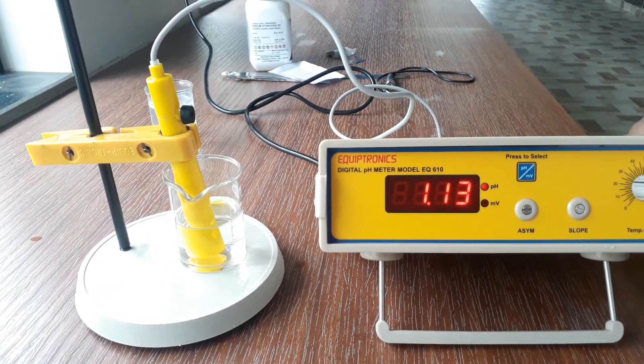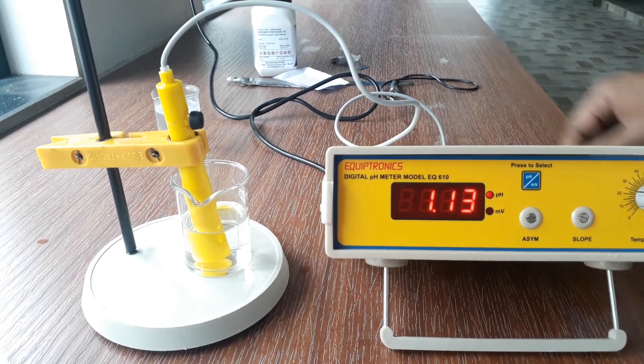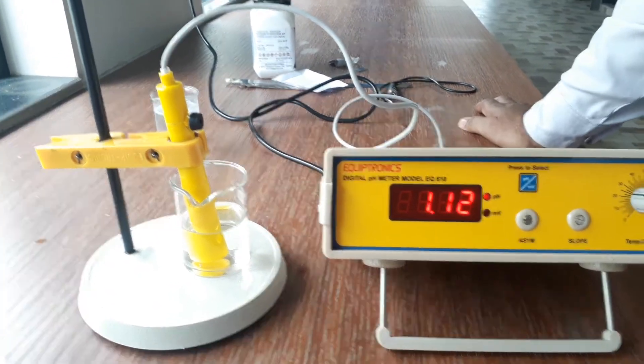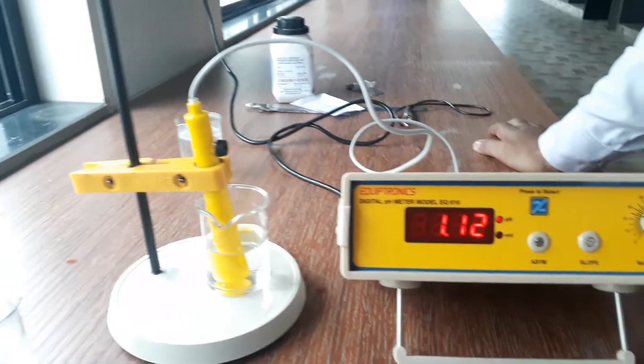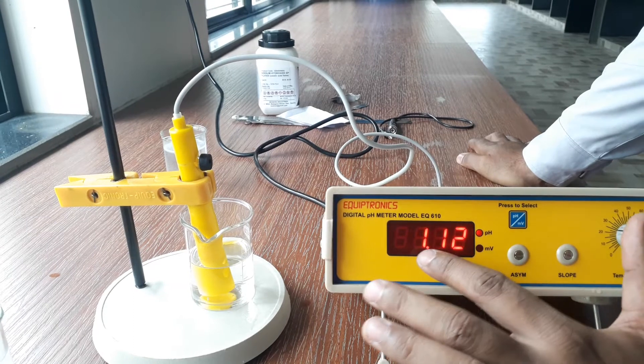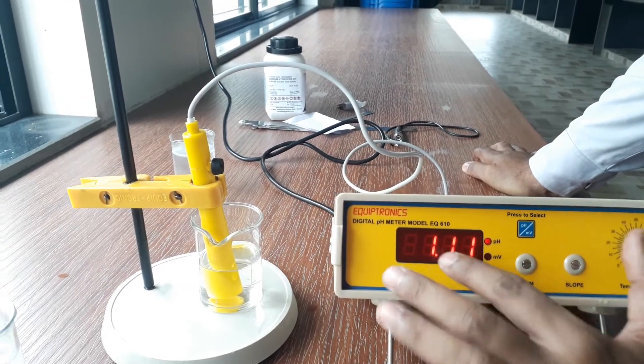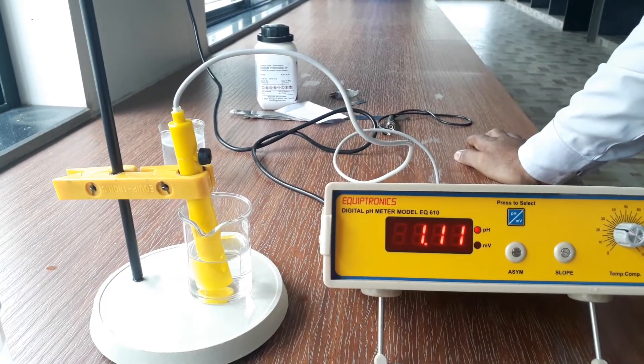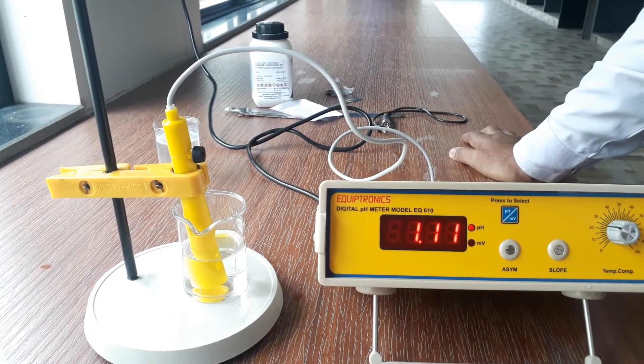But as we know the solution is HCl and we also know the range of HCl pH, that is from 1 to 2 according to its normality. Different pHs are there but it is nearly 1 to 2. So you can see that the pH value is also matching, that is 1.12 which is the pH value of hydrogen chloride, that is HCl.